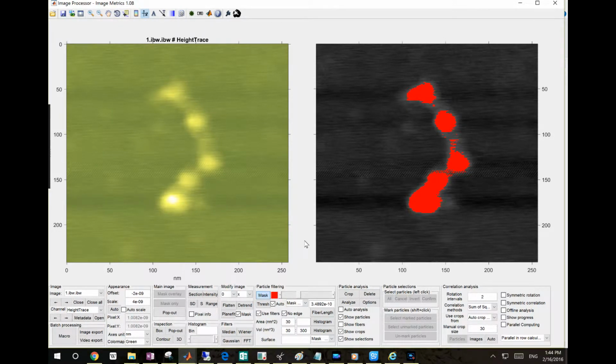In this video, I'm going to show you how to do basic image measurements. There are several options. You can do image section analysis, you can do image intensity plot, you can also do image reference analysis. I'm only going to talk about section analysis and intensity plot in this video. The reference analysis is similar to image collection chapters, so I'm going to include it when I talk about image collection. That's in another video.